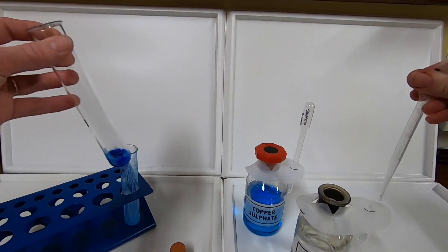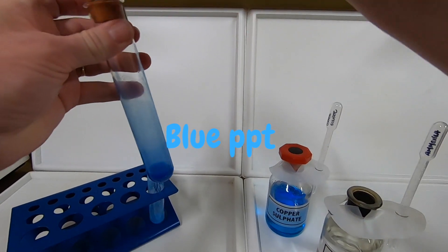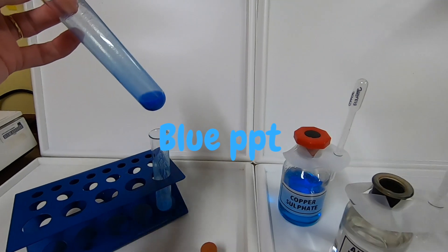We're going to repeat the practical. This time, again adding a few drops, we will see the blue precipitate of copper hydroxide form.